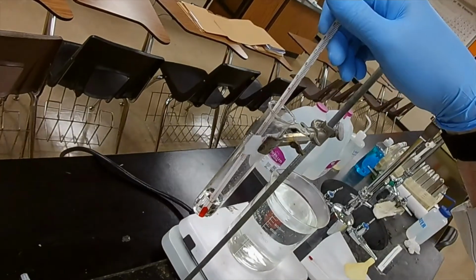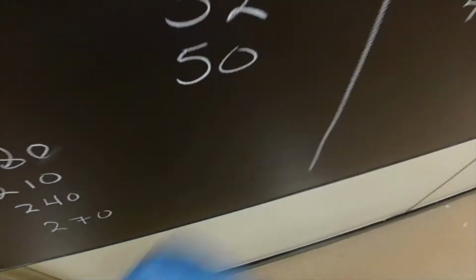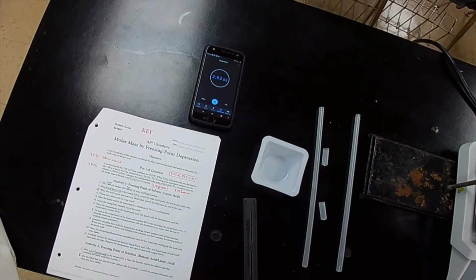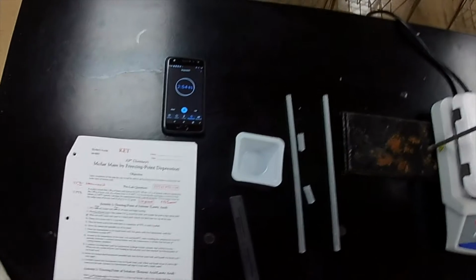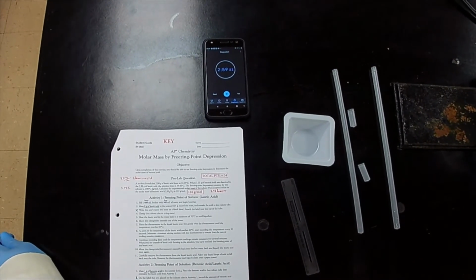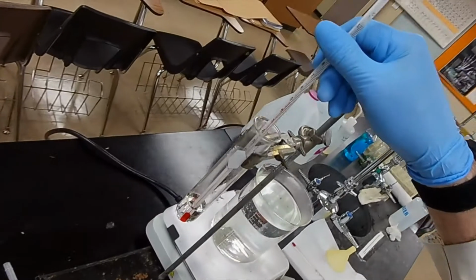Okay, here we come up on another 30-second measurement. Now, 50 degrees. And the other way is to plot your data. And I'll show you after we've gathered all our data what that looks like. Okay, another measurement, 48.5.